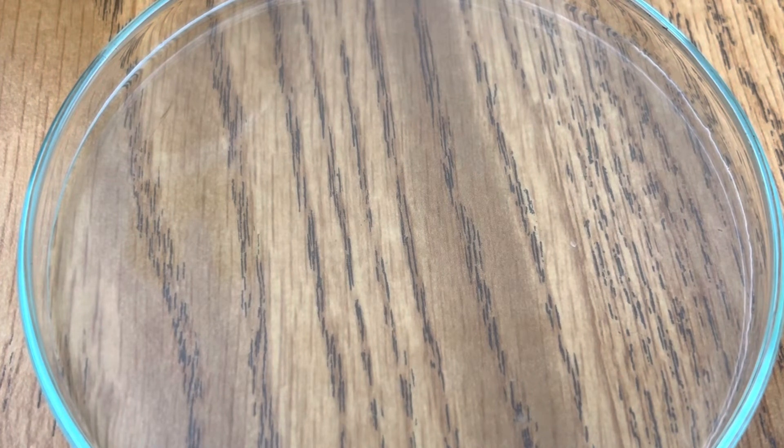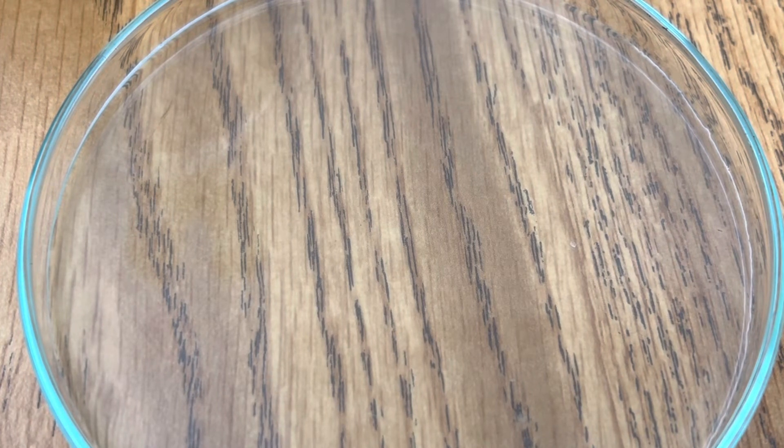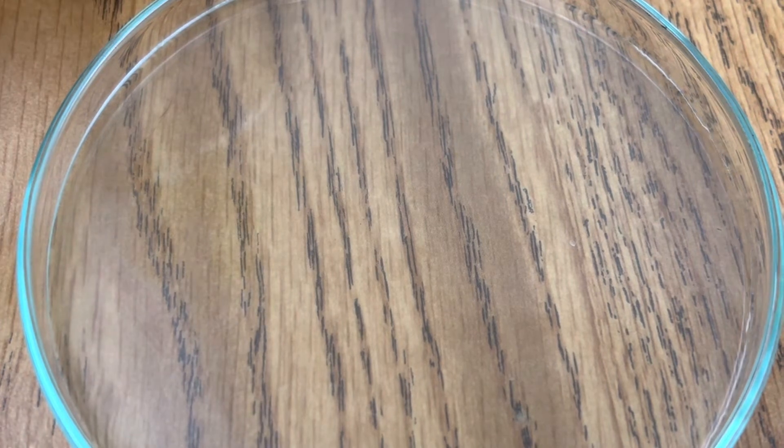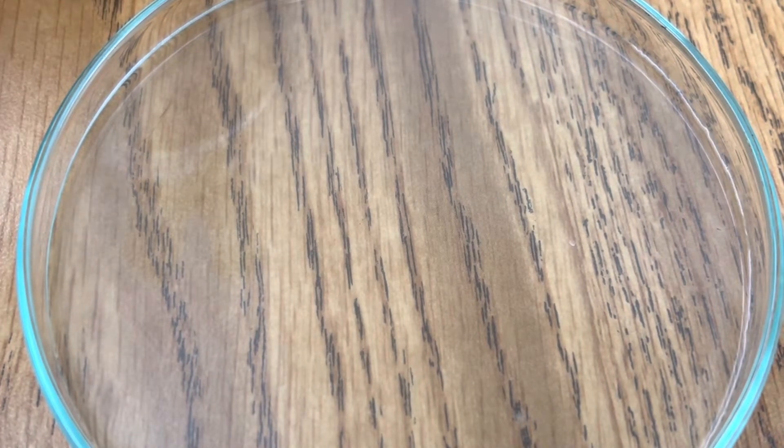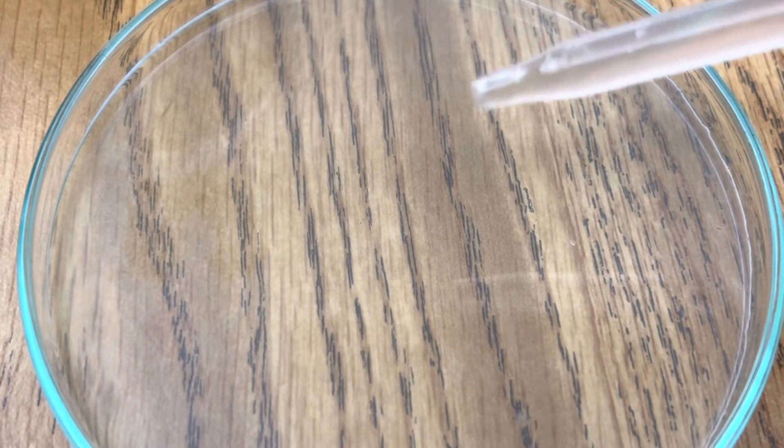Once you have an aqueous solution of barium chloride, you're ready to add drops of sulfuric acid to your petri dish, and you will see the precipitation of barium sulfate, a white, cloudy precipitant. Here we go.